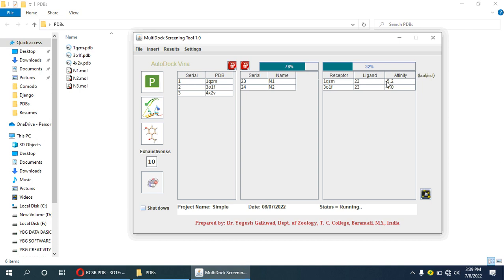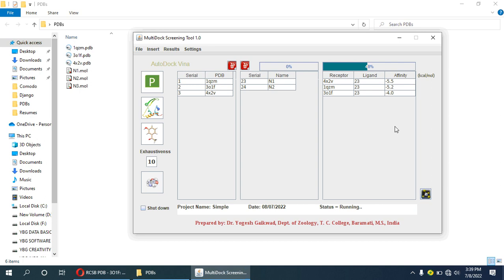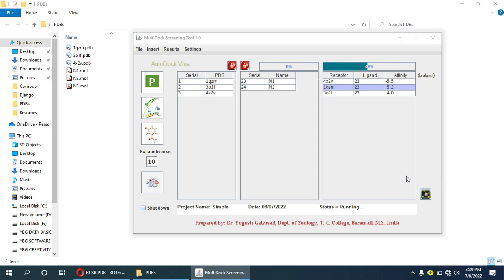Now we can visualize the results by selecting a receptor and ligand combination. I will select this one and we can visualize the results in PyMOL.